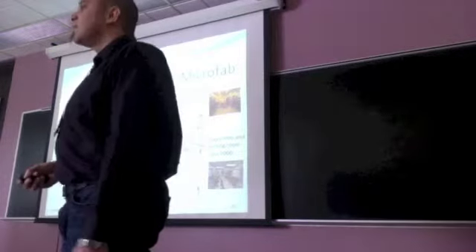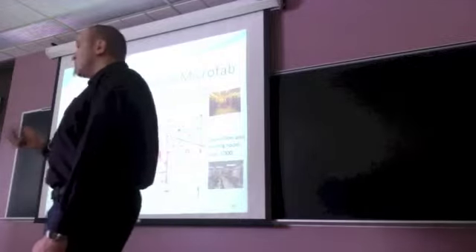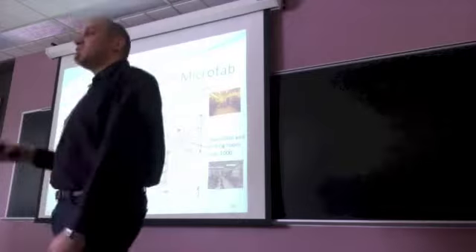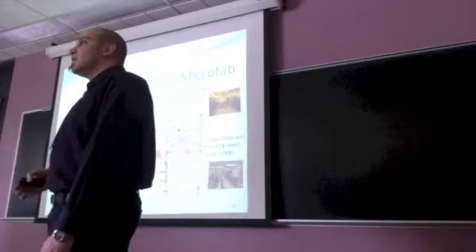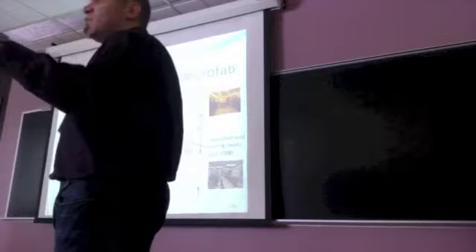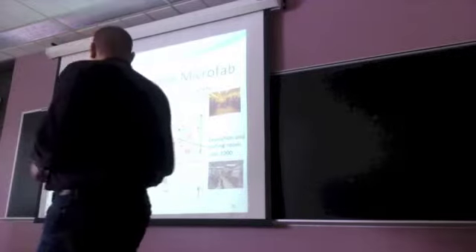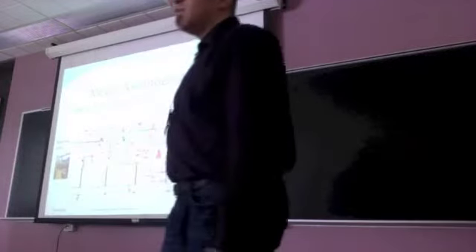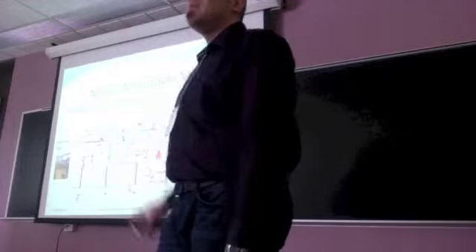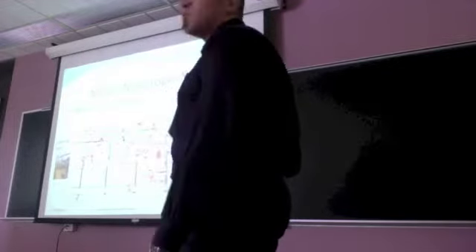We don't want UV lights. Yes, we want to block UV lights, because the standard white light from the ceiling has a small range of UV. Also, UV from the sun: you will see that we have windows with a yellow screen to block UV. So there are different sources of UV, and we don't want to expose the wafer to the small UV emission from white light. That's why the light is completely yellow.